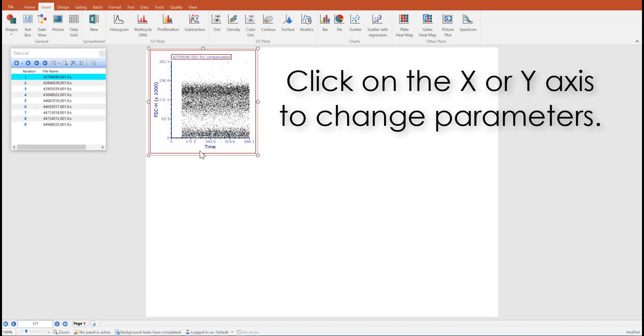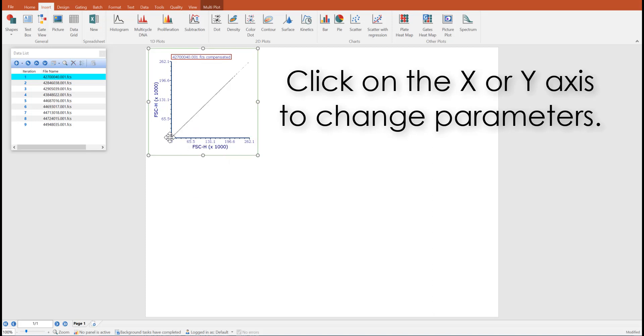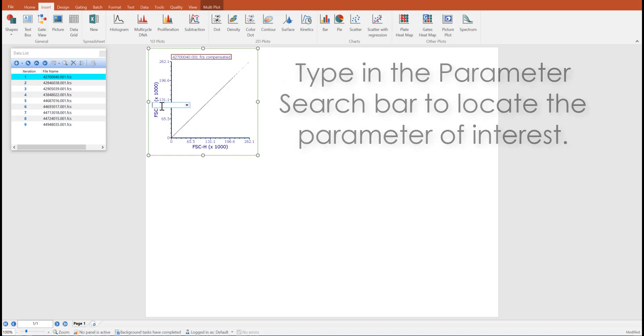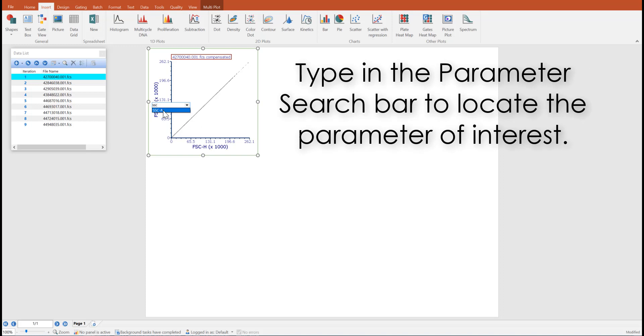Click on the x or y axis of your plot to change your parameters. You may also use the parameter search bar to locate the parameters of interest.